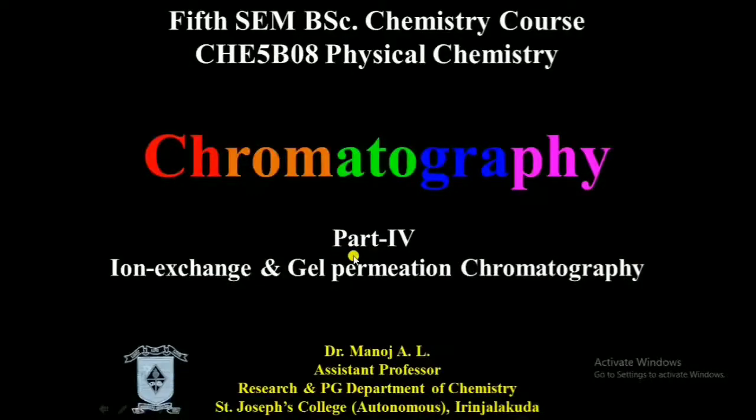So dear students, in the fourth part of the chromatography lecture, we will discuss two kinds of chromatography techniques. One is ion exchange chromatography and the second one is gel permeation chromatography. Both these techniques are examples of liquid-solid chromatography, where the solid phase is the stationary phase and the mobile phase is a liquid.